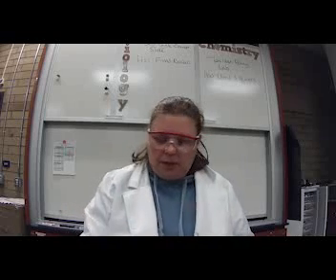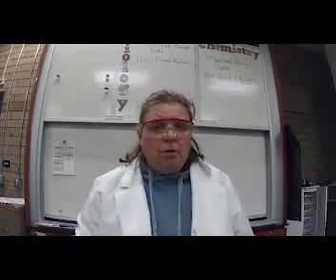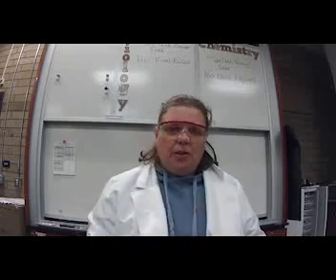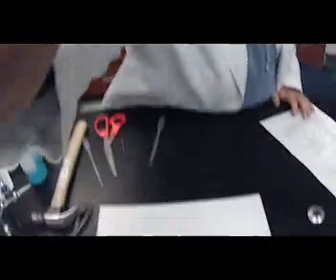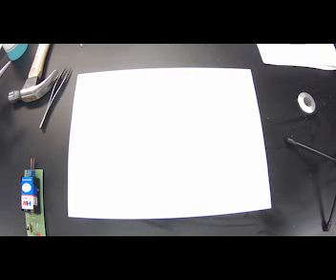I'm going to go ahead and point that camera down so you guys can see what's going on down below, because you don't want to look at me. You want to look at the metallic bonds. So let's go ahead and point our camera down. This is where we're going to kind of work. We'll see how that works on the camera. Change it back to the black if we need to, okay? But the first one we're going to look at is aluminum, okay?